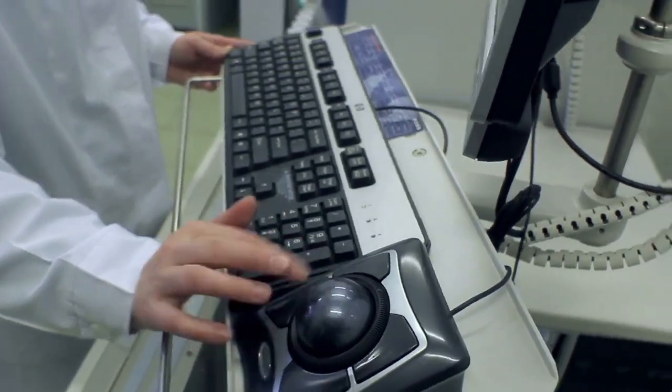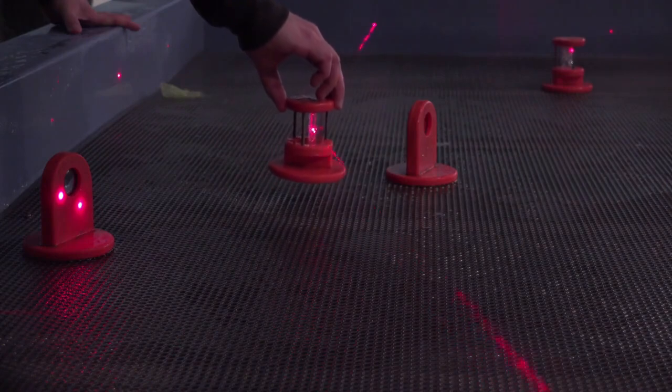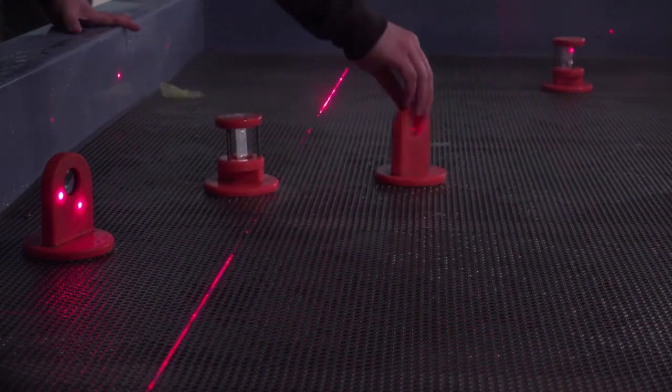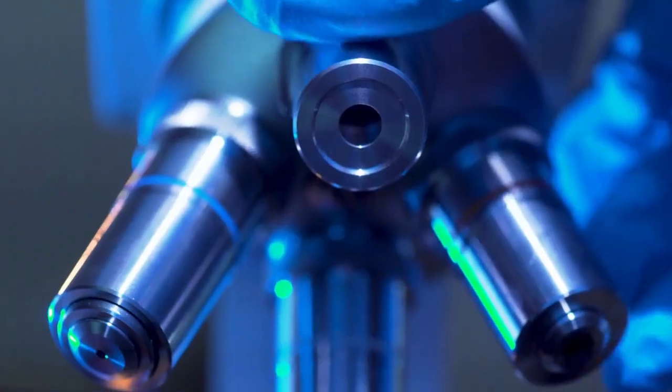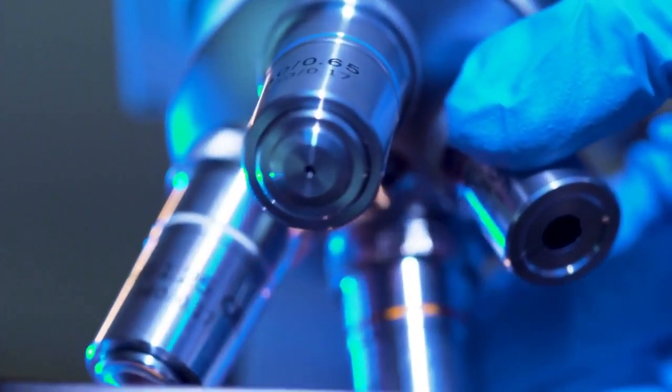So how does it all work together? A laser beam is directed through the microscope's objective lens and focused onto the sample. The light interacts with the molecules in that tiny spot and scatters in all directions. The same objective lens collects this scattered light and directs it into a device called a spectrometer. The spectrometer separates the light by its energy, much like a prism separates white light into a rainbow.